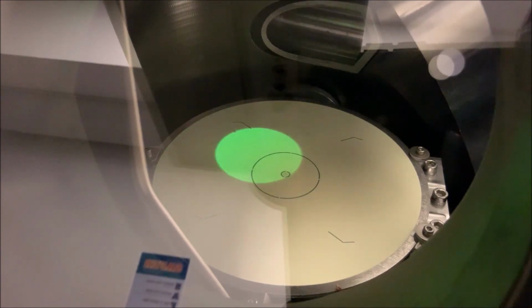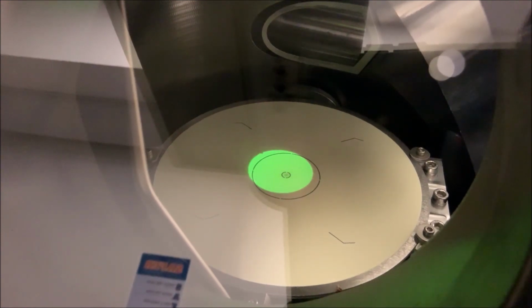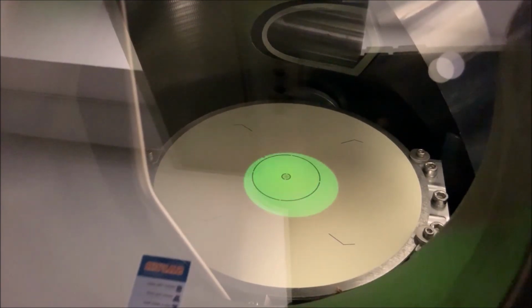To center the C2 aperture, use the magnification knob on the right-hand panel to set the indicated magnification to 86,000x. Then expand the beam from crossover by turning the intensity knob on the left-hand panel clockwise until the beam is approximately the size of the 4mm circle on the viewing screen. Then use the trackball on the left-hand panel to center the beam on the viewing screen. Turn the intensity knob clockwise to expand the beam.